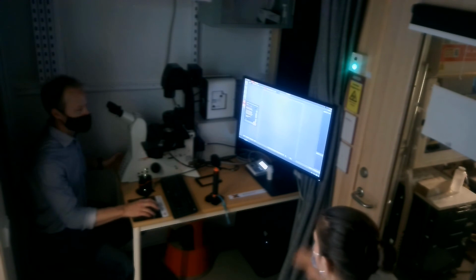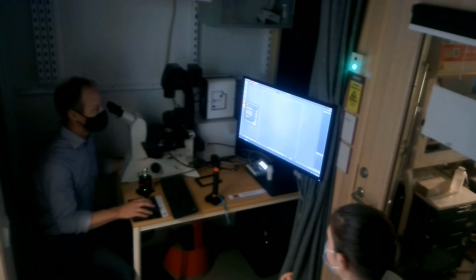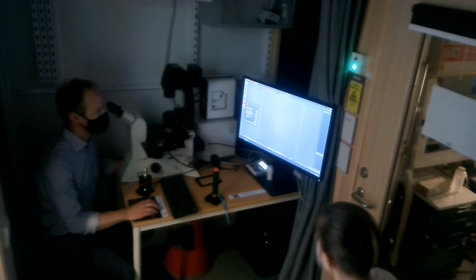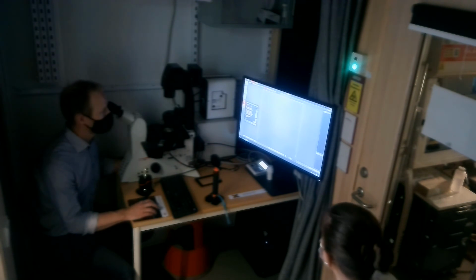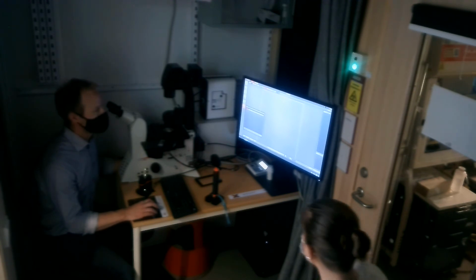So it's basically how it gets stitched together. Exactly, how the overlap region will be handled. So smooth is most likely where you will be. I work mainly in life science, so smooth is where we are always. The other one is carrier, and the carrier is where we can load sort of an avatar.